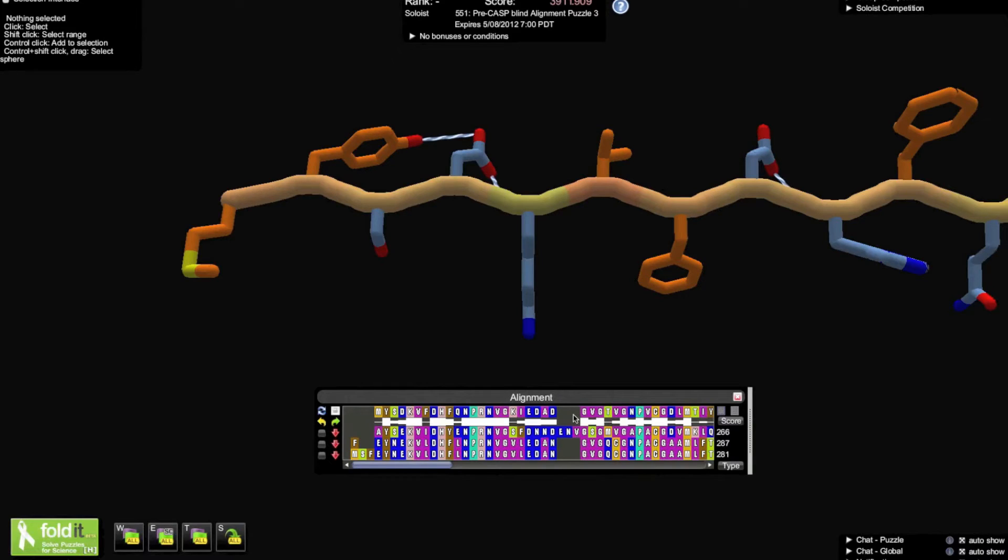As a quick note, this alignment score is calculated very differently than the way Foldit scores proteins. A high alignment score means a higher degree of confidence that the templates are related to the CASP target.